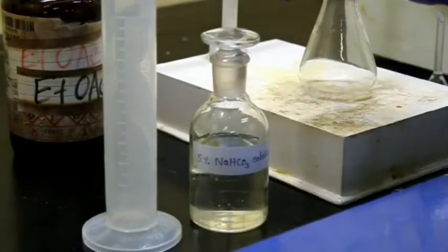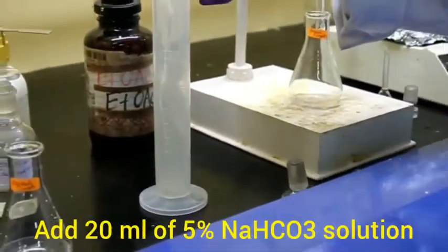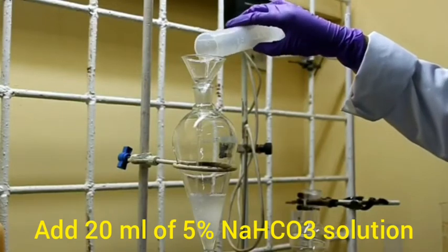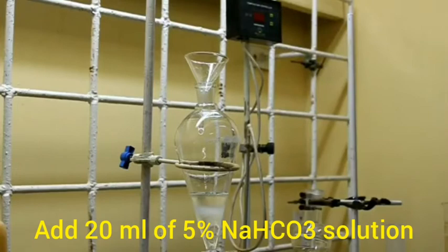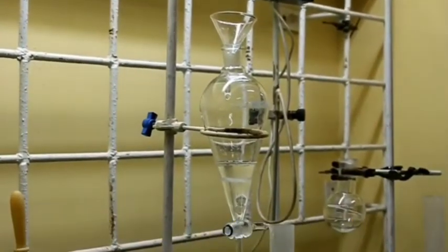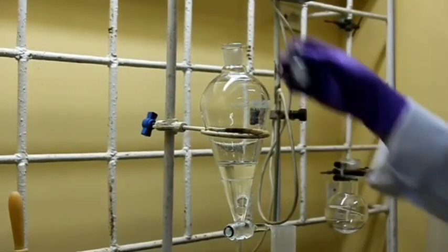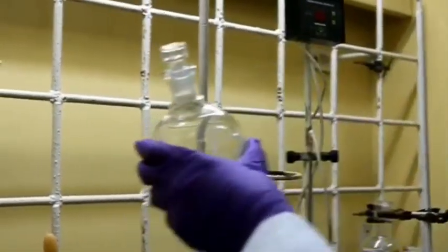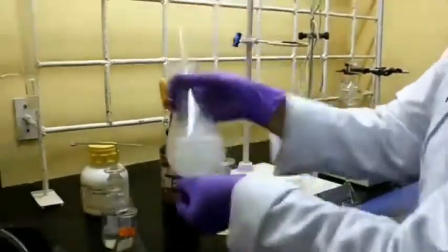Now we are measuring 20 ml of sodium bicarbonate solution. We are adding the bicarbonate solution to the organic layer to remove the unreacted acid which is formed during the reaction. We are shaking the separating funnel.